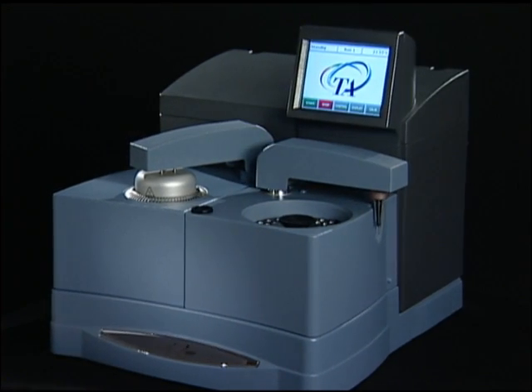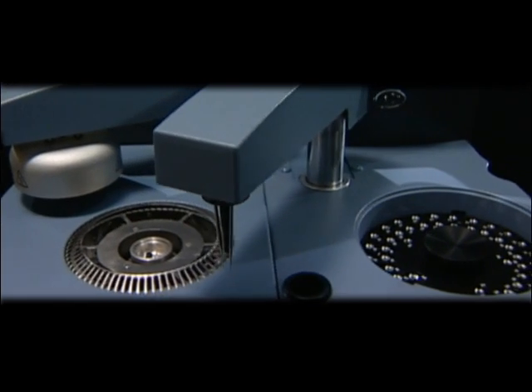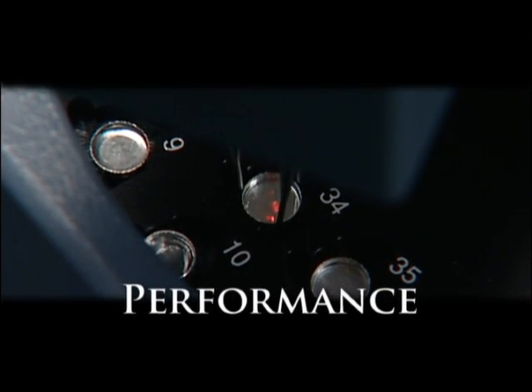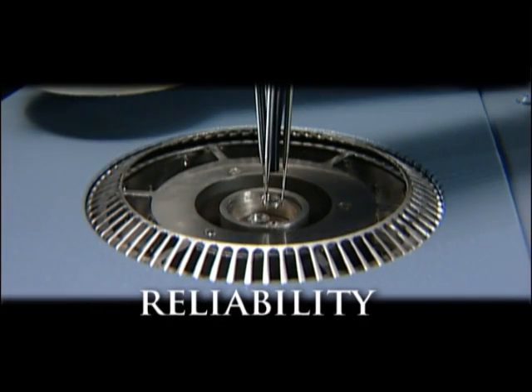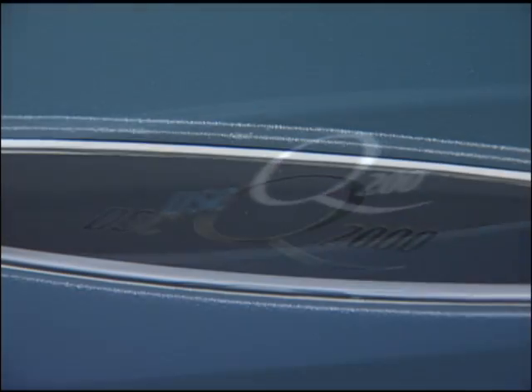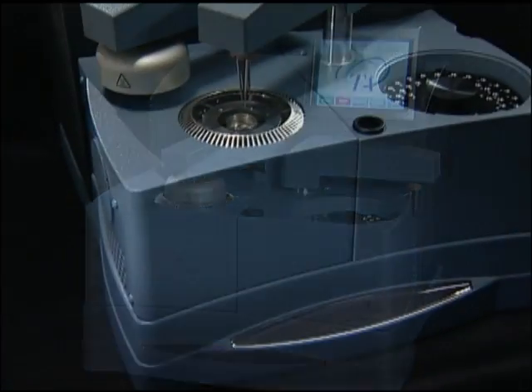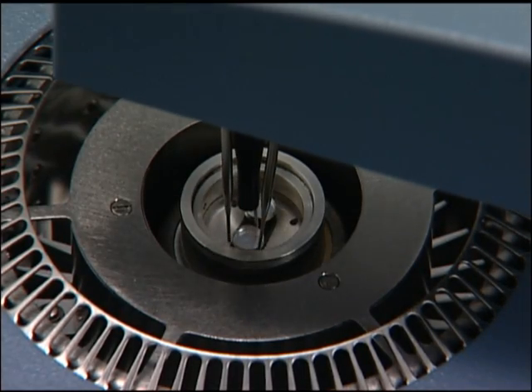In today's demanding laboratory environment, any new product investment must provide the highest levels of technology, superior performance, advanced versatility, and unmatched reliability. The new Q-Series products from TA represent the culmination of a 45-year commitment to continuously innovate in the field of differential scanning calorimetry.